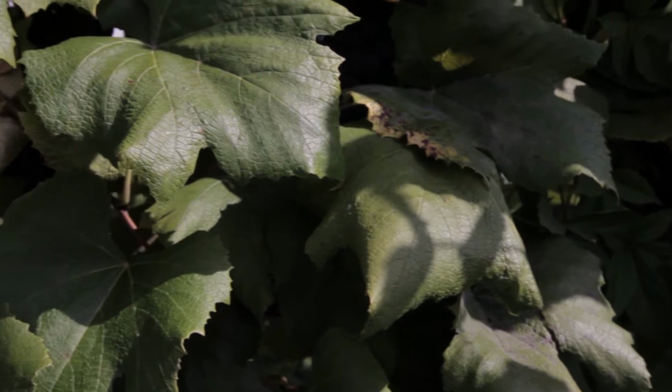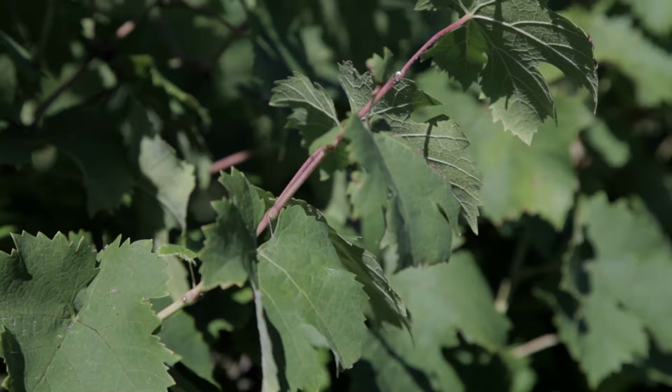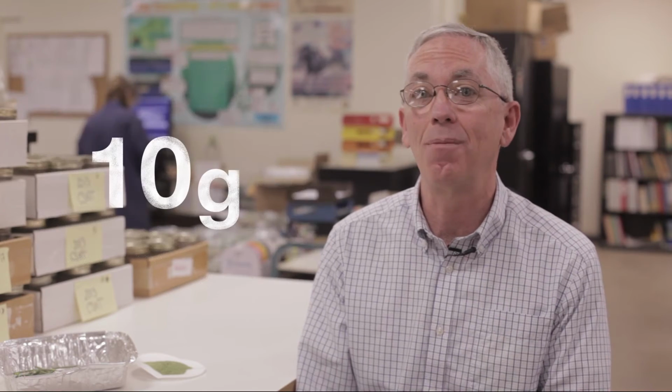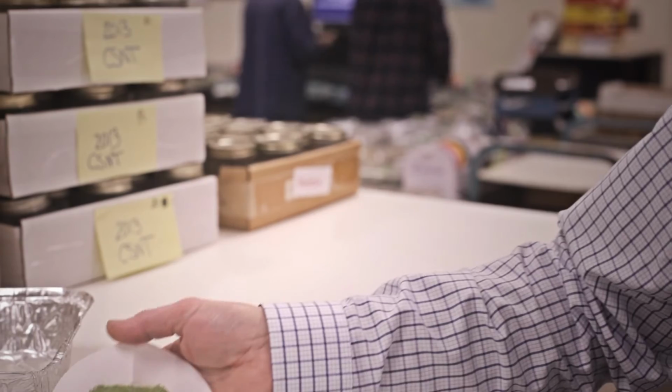You have to remember that the plant tissue itself is about 80% moisture, and it's the dried ground sample that we actually analyze. So once that 50 grams is dried, we're left with about 10 grams of material. This is what it looks like after it's dried and ground. So there's really not that much sample left over. So it's very important to have a representative sample, and along with that, complete paperwork.